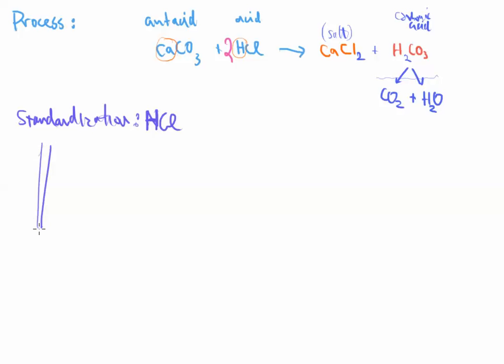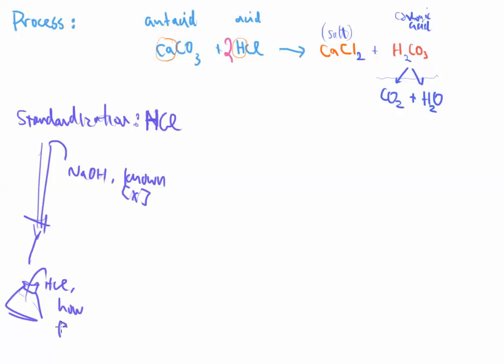In my burette, I've got sodium hydroxide, and I know the concentration. In my flask, I've got hydrochloric acid, and I know how much because I pipetted. It's up to me to figure out the concentration of that acid.